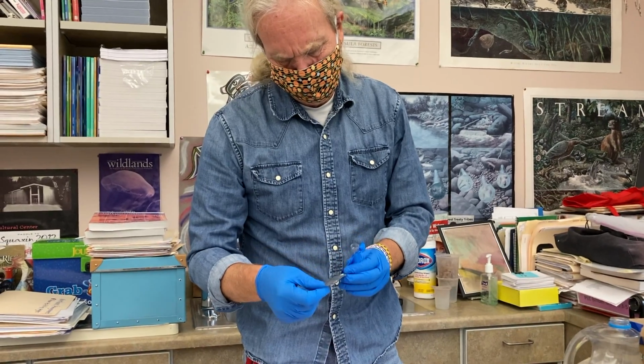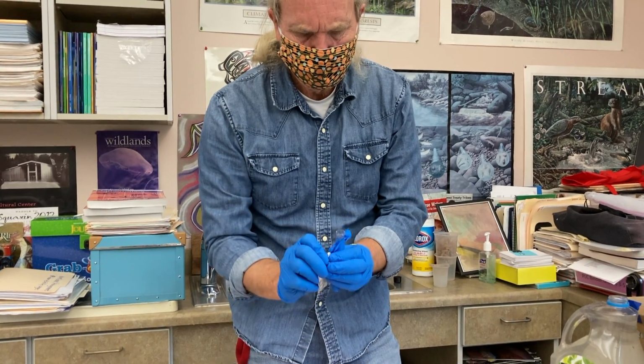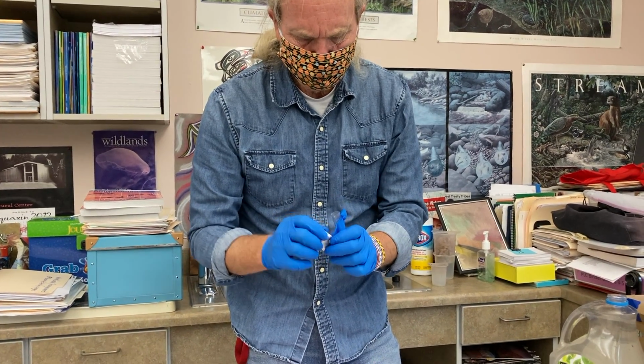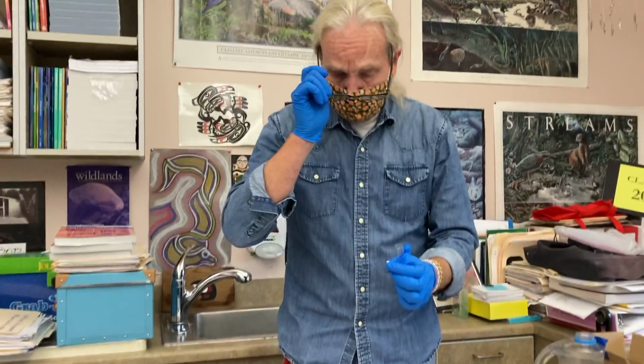And this one is number 2. So we'll put the number 1 in first. It's just like a little pill form. We're going to drop it in. But remember, that's why we're wearing gloves and goggles or glasses. So I'm just dropping it right in. Put the cap back on. Keep the sunlight off it. This can take a couple minutes sometimes to dissolve.